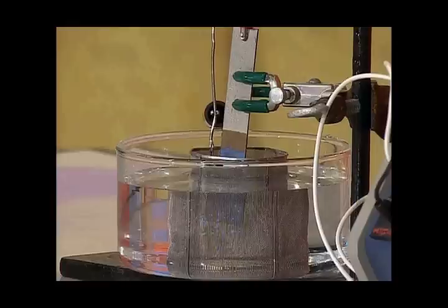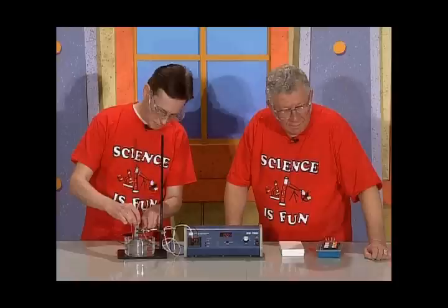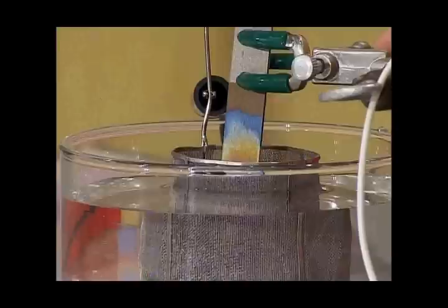Let's turn up higher voltage. Turn it on for a little while. And it develops more coating. The coating is getting thicker. I turn it off. Turn it up. Move up the strip. Turn it on. At an even higher voltage, where are we? Oh, 60 volts already. Yeah, that's high. Okay, and I'll do one more. Lift it up a little bit further and turn up higher voltage still.